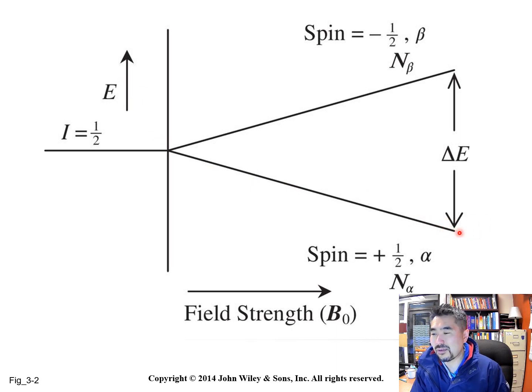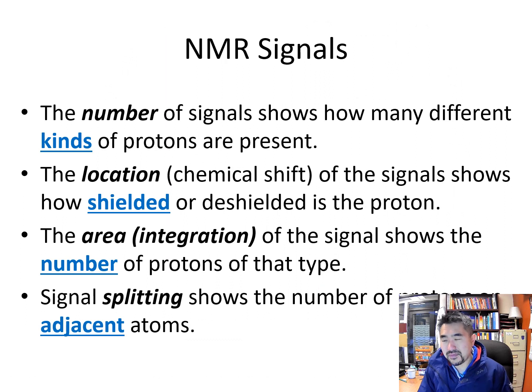And if you irradiate these with radio wavelength radiation, you could flip the nucleus spin direction to the other direction, and then this could sort of relax back down to the previous spin state or spin direction, and that's what we are measuring with NMR detection. It's a radio wave detection. Okay? And remember those NMR signals that we observe have gone through what's called Fourier transformation, so that it seems like very usable signals.